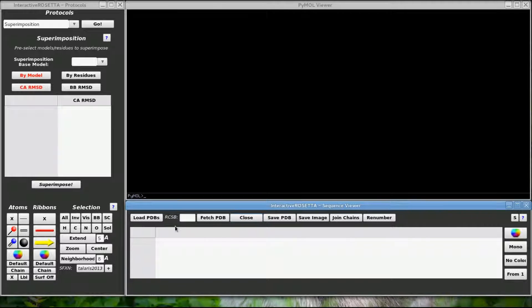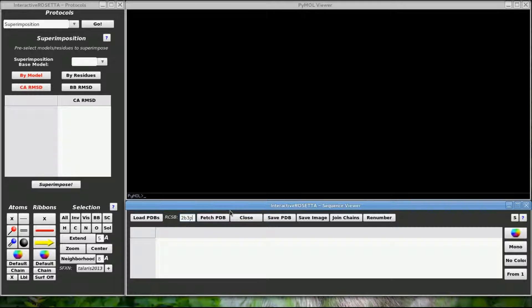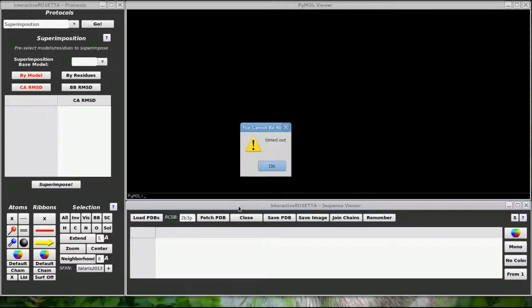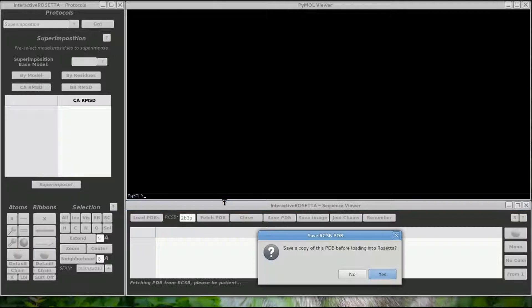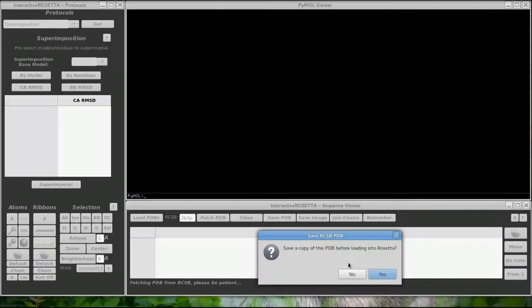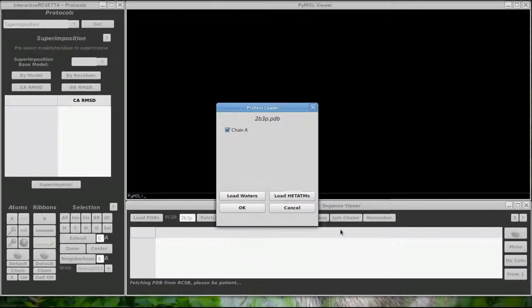Let's say I want to look at GFP but I do not have a local copy of GFP, but I know that the PDB code for GFP is 2B3P. As long as I have an internet connection, I can input the code here and then fetch the structure from RCSB. It will ask me if I want to save a local copy before loading into Pymol. I don't need to do that though.